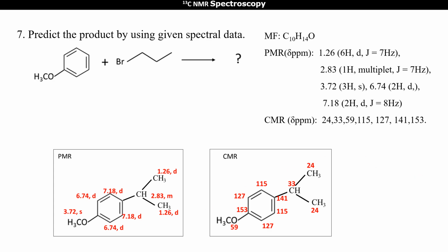Thus, in this video we discussed the different types of CMR spectroscopic problems.